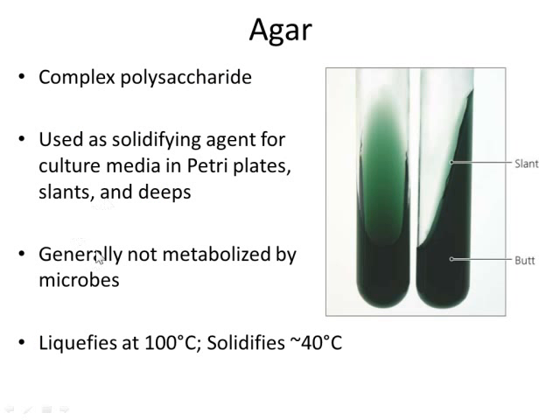So now let's talk about culture media. One important concept here, and we've discussed it earlier, is that we could have liquefied media, or we can also have solid media. Now, as we'll learn in lab, liquid media is great for fresh cultures. It also allows us to cultivate a large number of microbes.